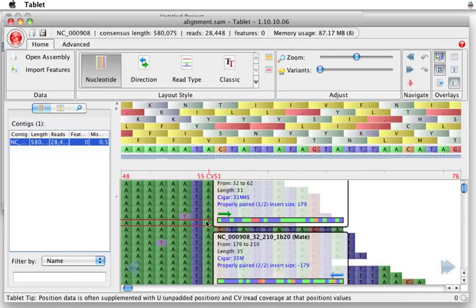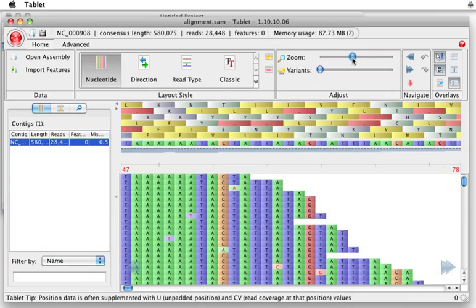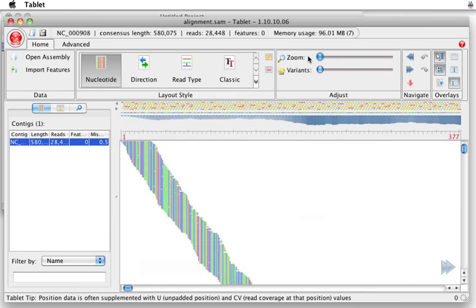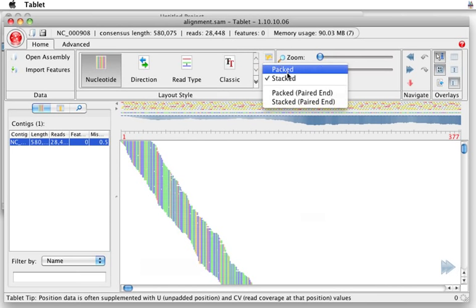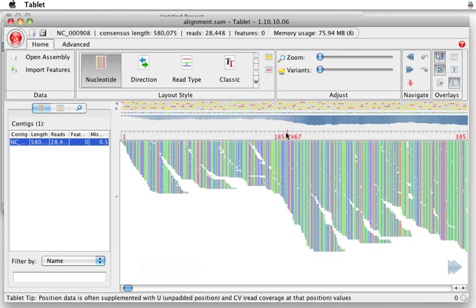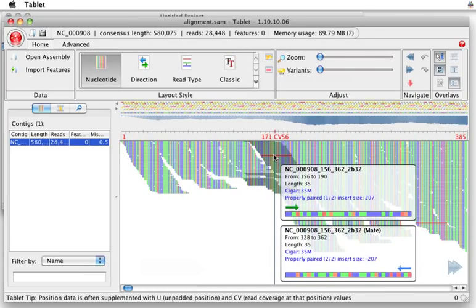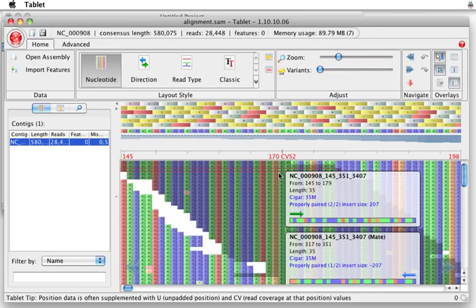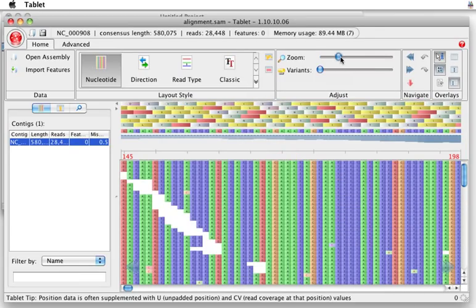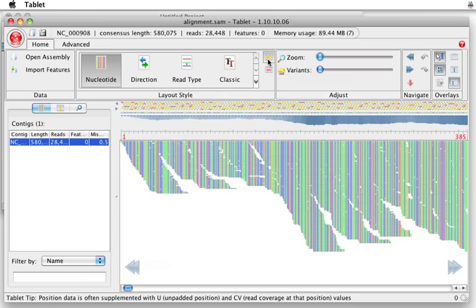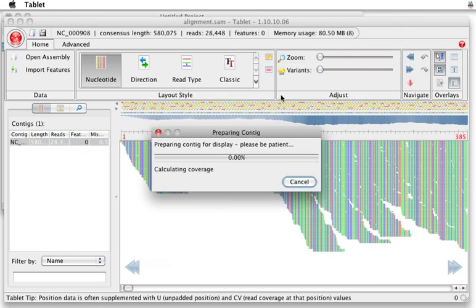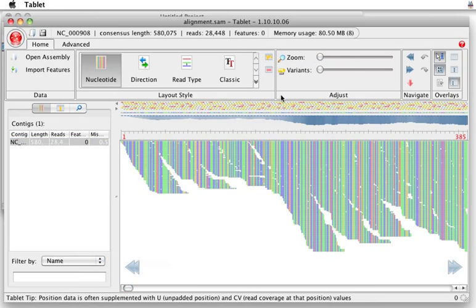I can zoom in by double-clicking, or I can use this zoom bar up here. There are some different views. The packed view. Same sort of thing.